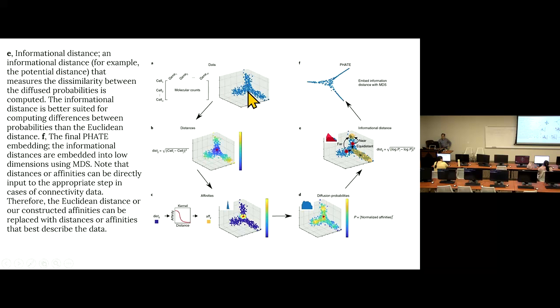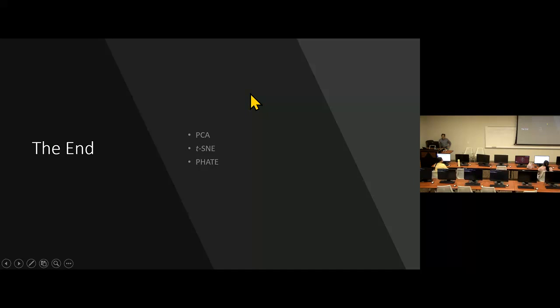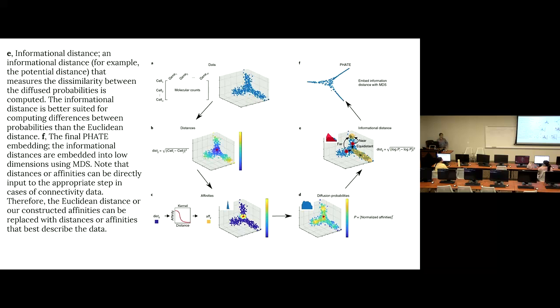So in this illustration, this structure is not much different from this. Okay, the input here and the final outcome. But in reality, if you have PCA embedding results, you will see, okay, this is very different. You can hardly tell the structure of the data. PCA will give you not so distinct a description of the cell population relationships. But at the end, you get this better one.